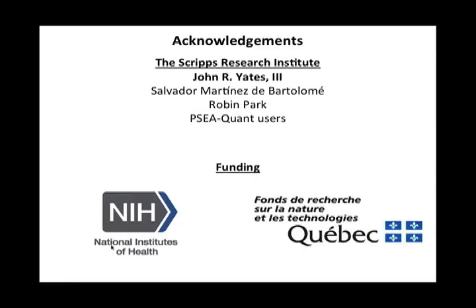And we've also submitted the protocol manuscript to Current Protocols in Bioinformatics on September 15 of this year. We think that this will be very useful for more novice bioinformatics users to understand what options to select with PSEA-Quant, how to interpret the results, and how to troubleshoot a data set that was analyzed with PSEA-Quant.